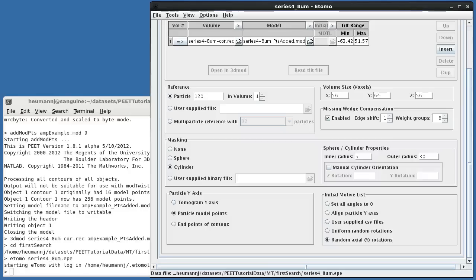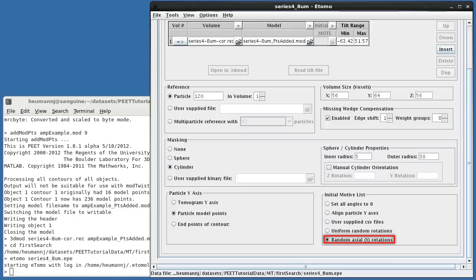We'd like the initial motive list to align each particle's y-axis to that of the reference. This can be accomplished by selecting Align Particle Y-Axis. In this case, I've selected Random Axial Rotations. This tells PEET to additionally apply a random axial rotation to each particle after aligning the y-axis with that of the reference. This helps minimize reinforcement of missing wedge artifacts and associated biases.